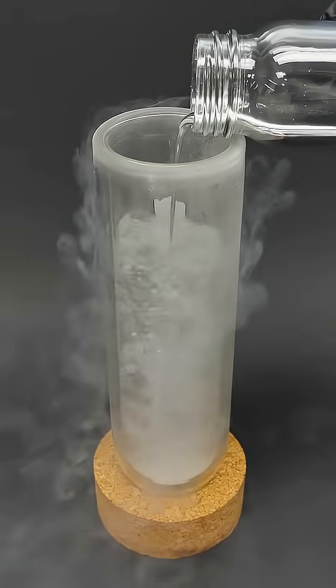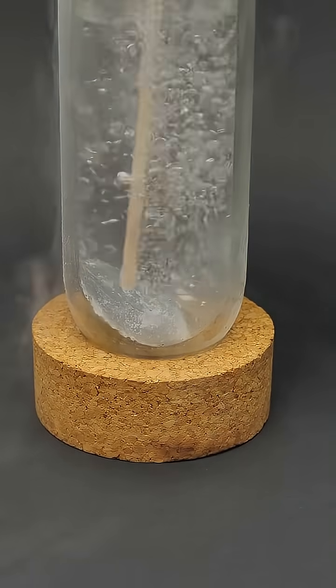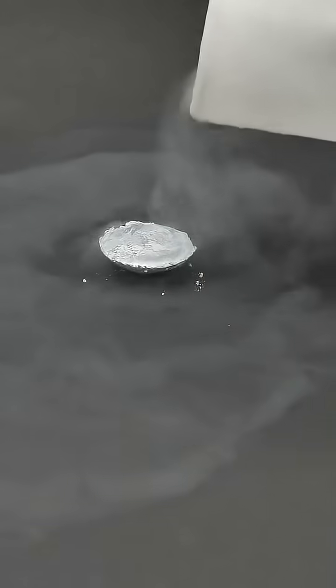I'm going full throttle and using liquid nitrogen at minus 196 degrees Celsius. The mercury goes directly into the nitrogen, which then begins to boil rapidly. And here it is now, a very nice solid block of mercury.